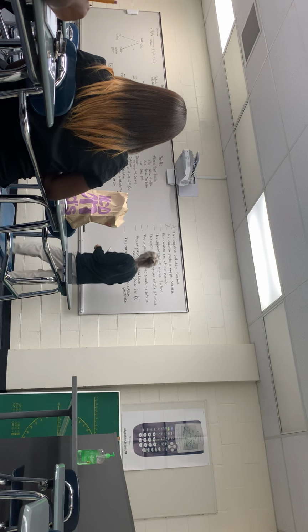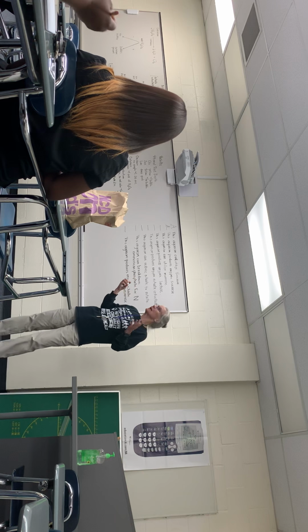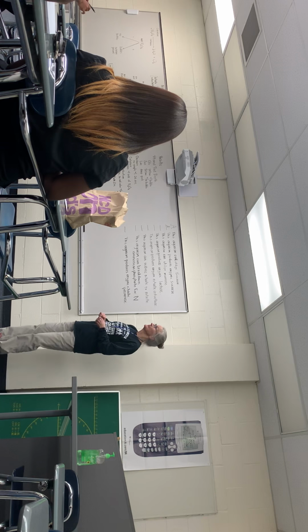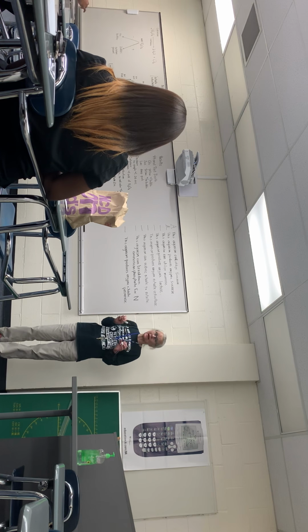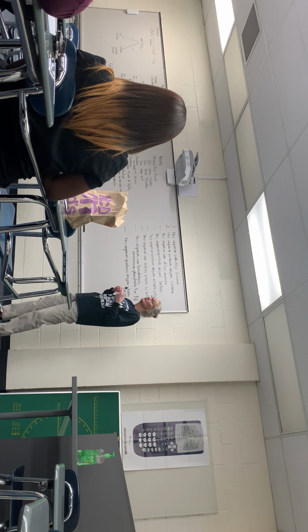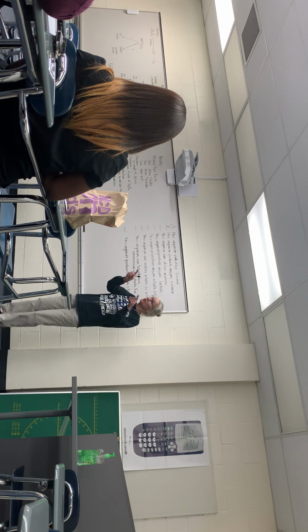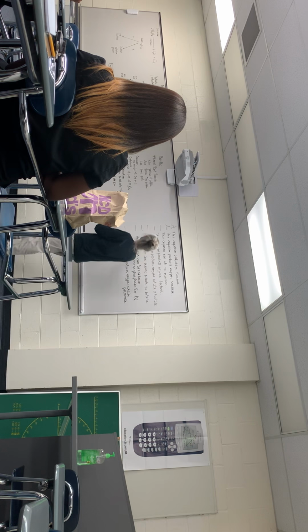What if I said this organism can utilize mannose? Or I could have said ferment mannose. That can't be determined. And why can't we determine that? We didn't use mannose. We didn't do a phenol red mannose, did we? We didn't test that carbohydrate. So that's one of those where you would have to say can't be determined based on the results you were given. Remember, you're limited by the test results that you have. So you can't speak to anything outside the information that those tests give you. So that would be cannot be determined.